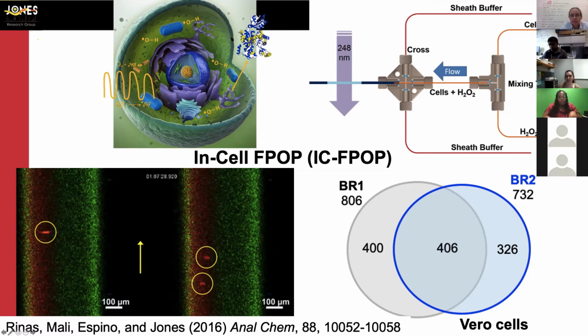So we just published a paper in Biophysical Journal where we coupled in vitro FPOP with ion mobility for cytochrome C, and we were able to separate out the conformers after FPOP. So we can actually see the peroxidase active conformer from just adding H2O2 versus the regular function of cytochrome C. So heme proteins are very difficult to work with because of the reaction of the heme with just H2O2 by itself. Which goes to show there's advantages and disadvantages to every single experimental technique. Yeah.